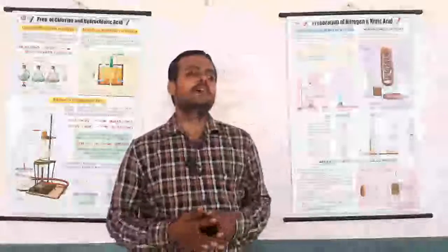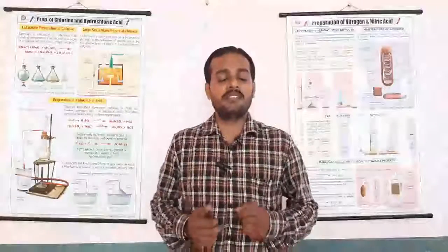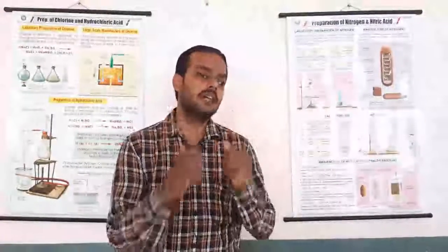Hello students, today I am going to show you the acidity and basicity of a sample. This is a class 10 practical showing the acidity and basicity of a given sample.